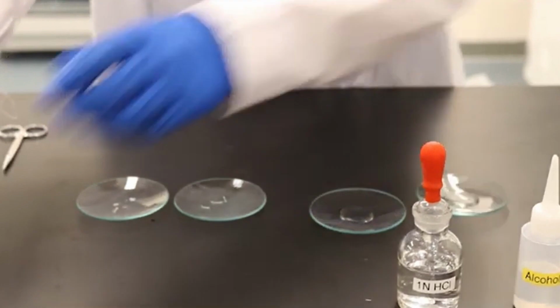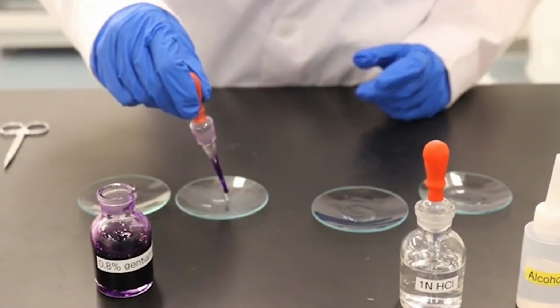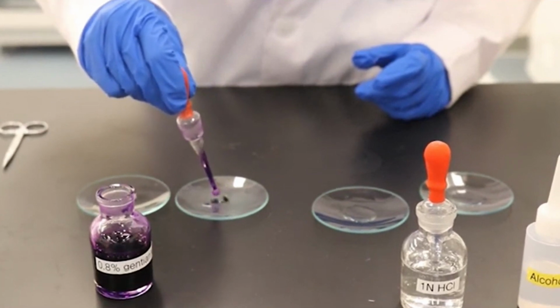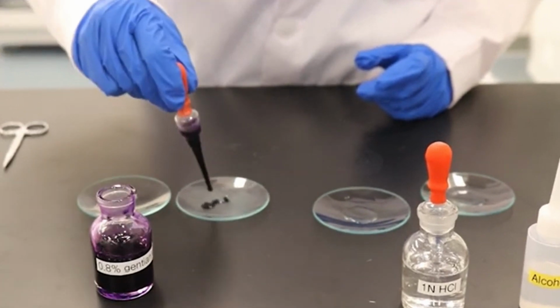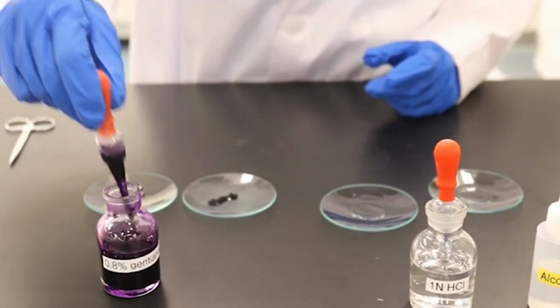In the following staining stage, roots are stained with gentian violet for 3 minutes, followed by washing off excessive stains using water. Gentian violet's purpose in this context is clear. It selectively binds and colors chromosome structures, making them visible for observation.